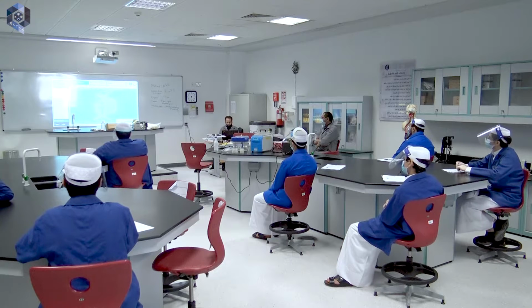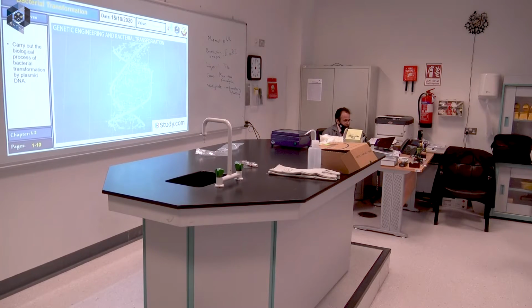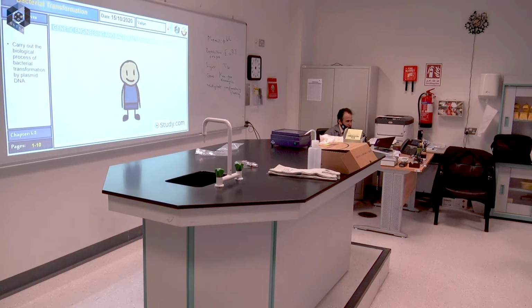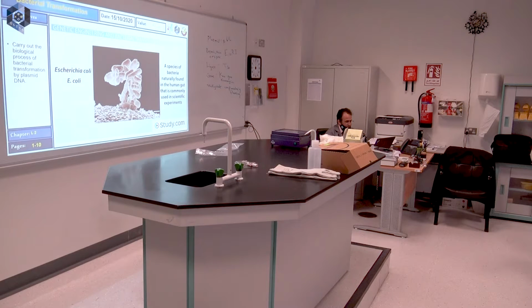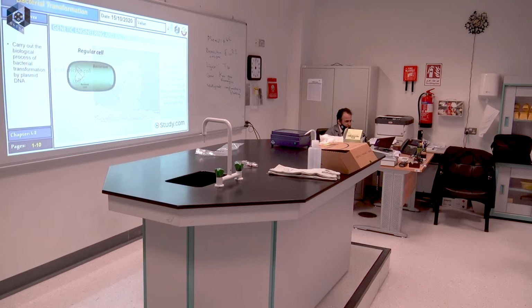Lucky for us, there are a number of ways to genetically modify bacterial cells. One of the most common procedures used in laboratories and classrooms alike is known as transformation. Transformation is the process in which the genetic makeup of a cell is changed by the introduction of DNA from the surrounding environment. Scientists commonly use the bacteria found in our gut in bacterial transformation experiments. This bacteria is known as Escherichia coli, or E. coli for short. E. coli is one of the most commonly used organisms in scientific experiments. Bacterial cells that are actively growing are most amenable to bacterial transformation. However, they must undergo a series of treatments before they are competent for transformation.